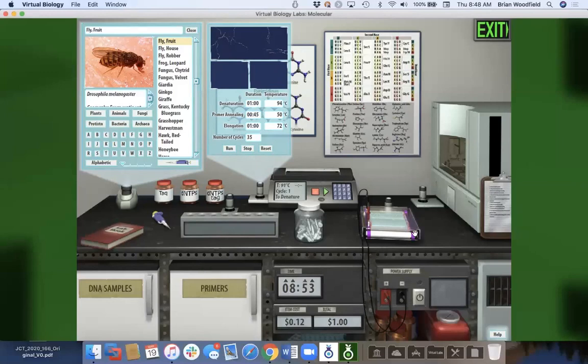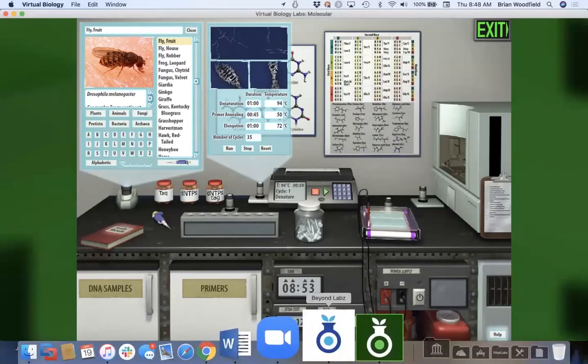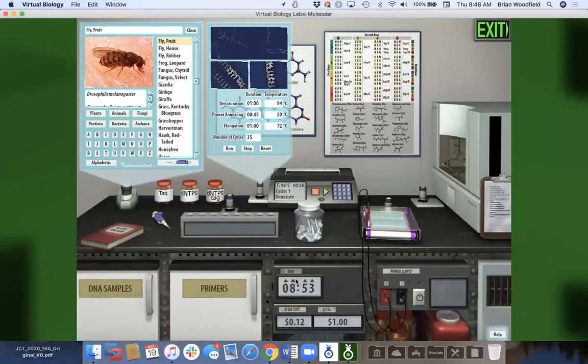Could you show how they could do one of these forensics experiments that we have? Sure, and how much direction they would get. Yeah, good idea. So obviously these labs can be super advanced. Like I said, though, we have presets.